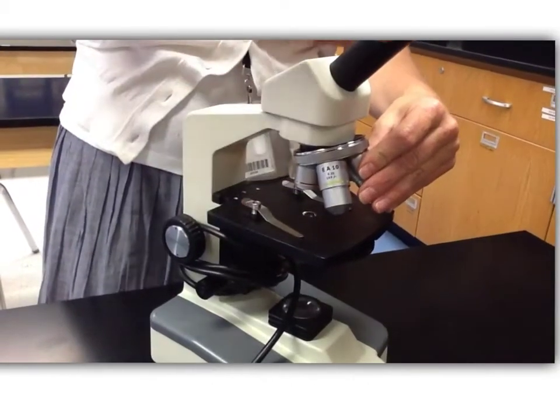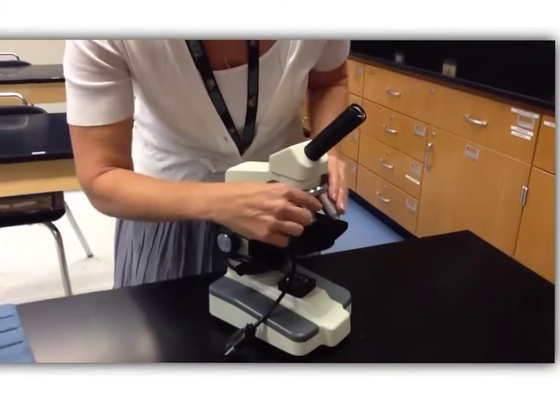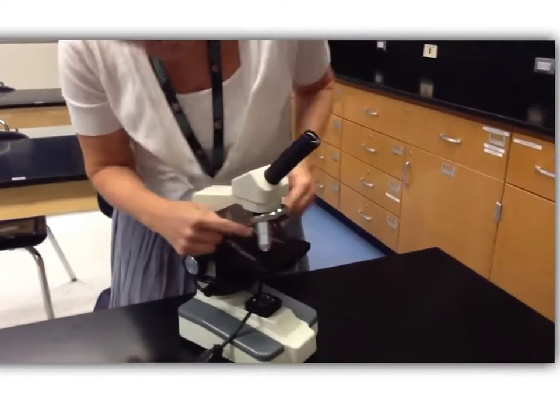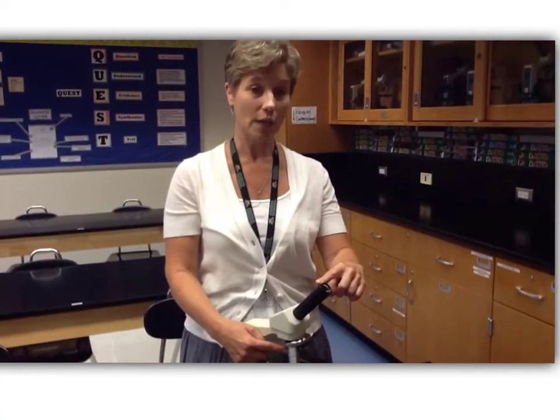If I'm using my 10 times ocular lens with my 10 times objective lens, that will give me a total magnification of 10 times 10, or 100 times.